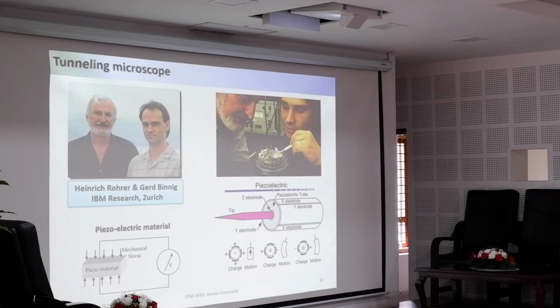What is the average surface roughness of this sample? On surface roughness, you can actually use any surface, I mean any surface height. I will come to that because it actually depends upon the feedback loop we are giving. This is a common question for AFM and STM, so I'll address that there. Because if the surface roughness is more than microns, the tip will go and crash.